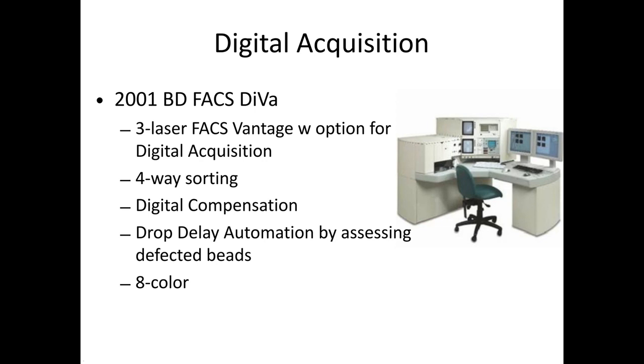They were just so ingrained in the classic visualization of analog compensation that they initially couldn't wrap their head around it. And I remember them telling me, oh, you're just a shill for BD. And I was like, whoa, no, I actually think this is right. The math, I understand it. Just because this is the first company to do it doesn't mean you should poo-poo it. And that kind of taught me a lesson there. It's like, wow, people are really ingrained in their habits, and it takes a lot of energy to change them.